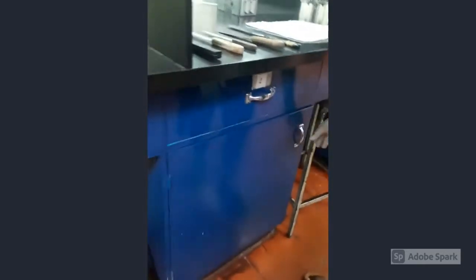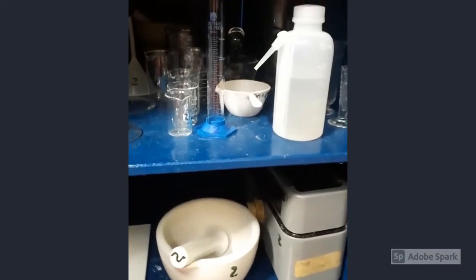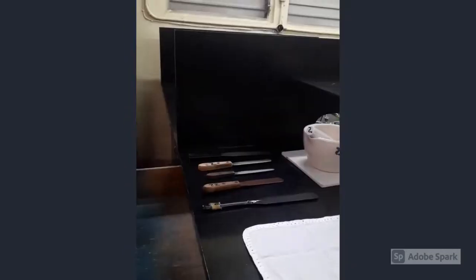Also below the cupboard, we have different equipment in the cupboard. Because there's no light there, we are going to take them out. You can see that different equipment are there. We are going to take them out and you can see what each equipment is, what is the name and what they are used for. All these equipment have been sanitized, so we are about to start to name them.